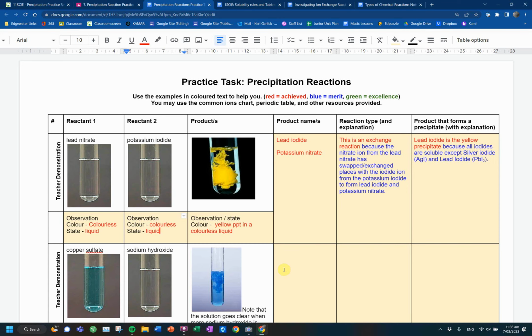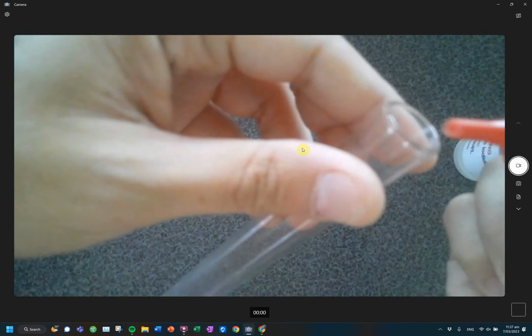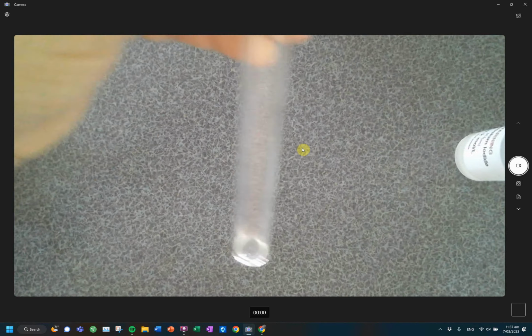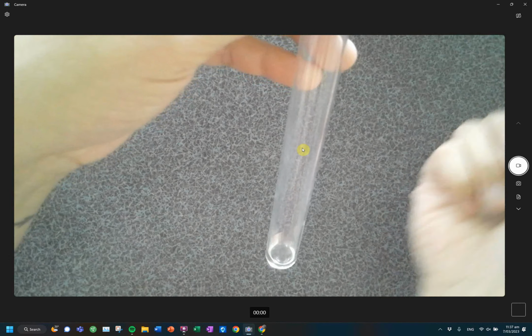Huh? I want to do a lot. Want me to do it again? Just because it looks pretty? It's basically what happened in this picture. All right. I'm going to do the other one. You guys will do it. You have 4 reactions to do. All right, ready?